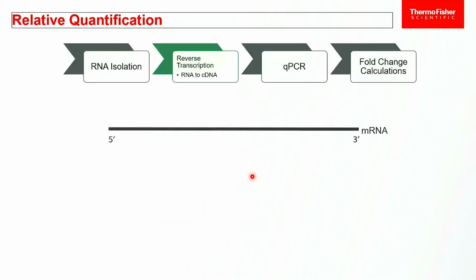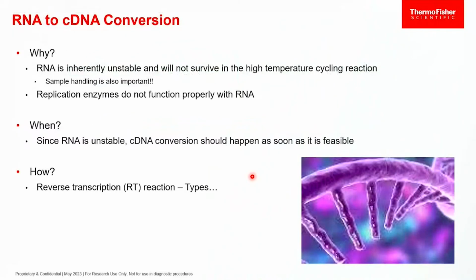I've sort of outlined a general experiment. So when we do gene expression, first we need to collect our RNA sample. Okay, we collect that, and then we have to do reverse transcription. We had a question about what is reverse transcription. So let's get into it.